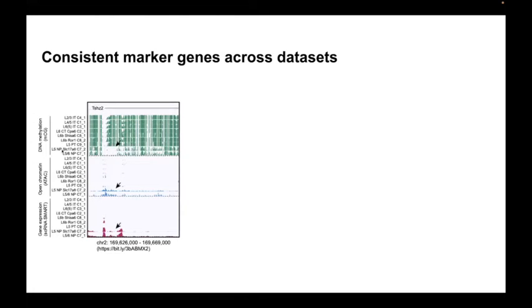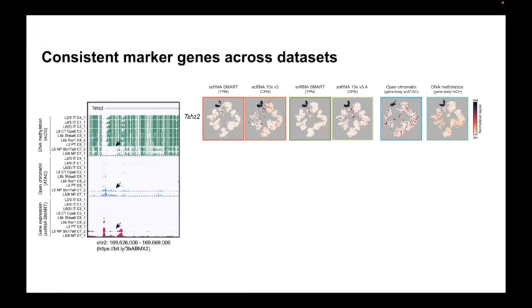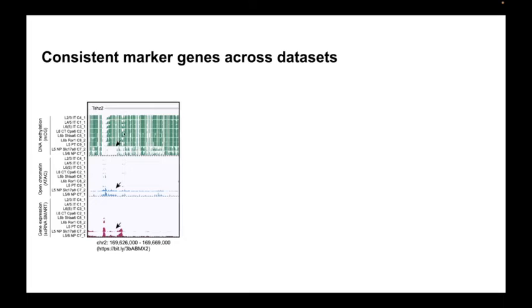Specifically in these 2 cell types, 2 different clusters of layer 5 near-projecting neurons. Now, what you also see in these very same cell types is high chromatin accessibility and high gene expression. And so this is an example where we can see in the browser the specific correspondence between cell types. And I'll get into more detail on this a little bit later, but the usefulness of looking at this in the genome browser, as opposed to other ways that you might represent the data, is that this really gives you a rich ability to see exactly where the different signatures are.